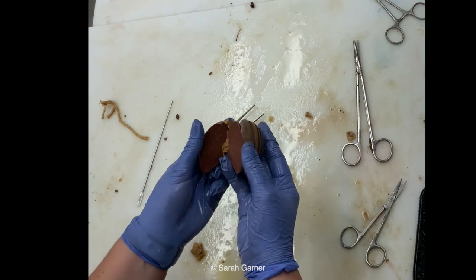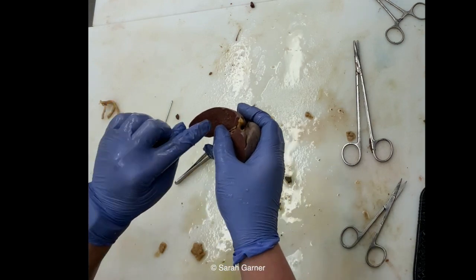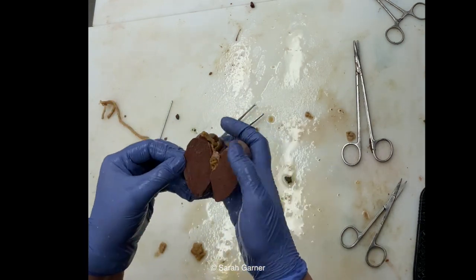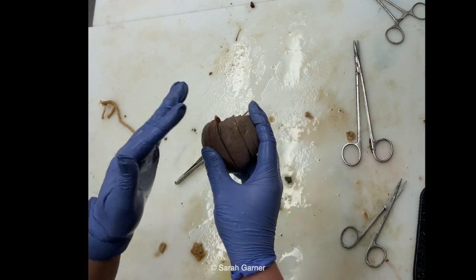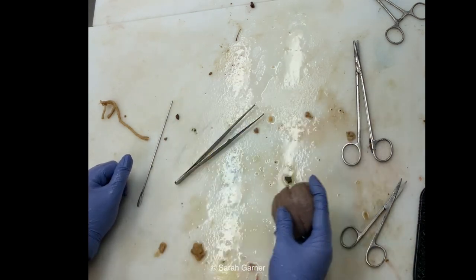So basically this looks like a fairly normal spleen. It's typically going to be a reddish brown, and then you'll see little dots of white. Since it's fixed, it's not as obvious, but this looks pretty normal to me. If you're doing the hospital autopsy, you'd probably submit an additional section of this as well, just to document it. So that is the abdominal block.